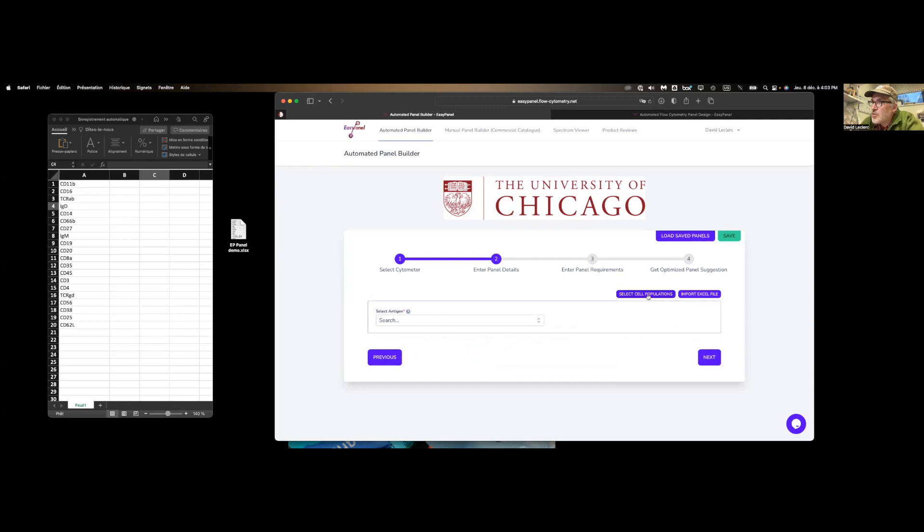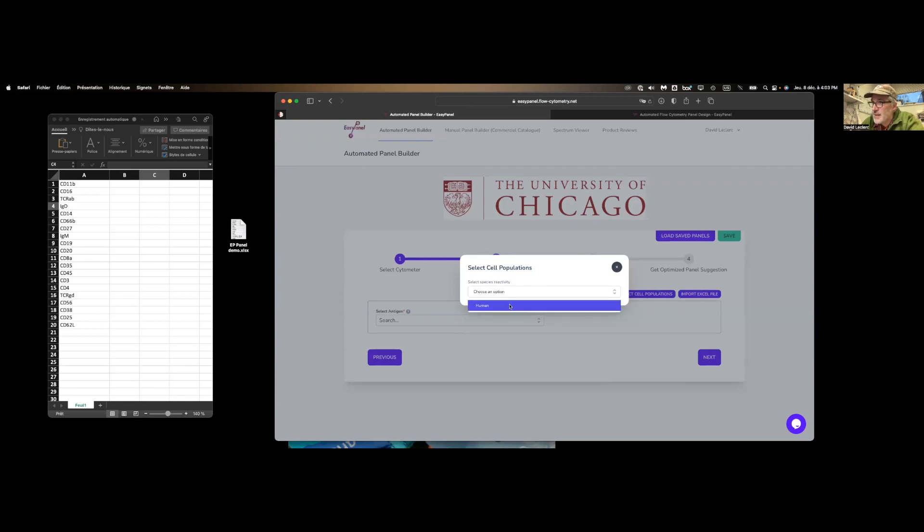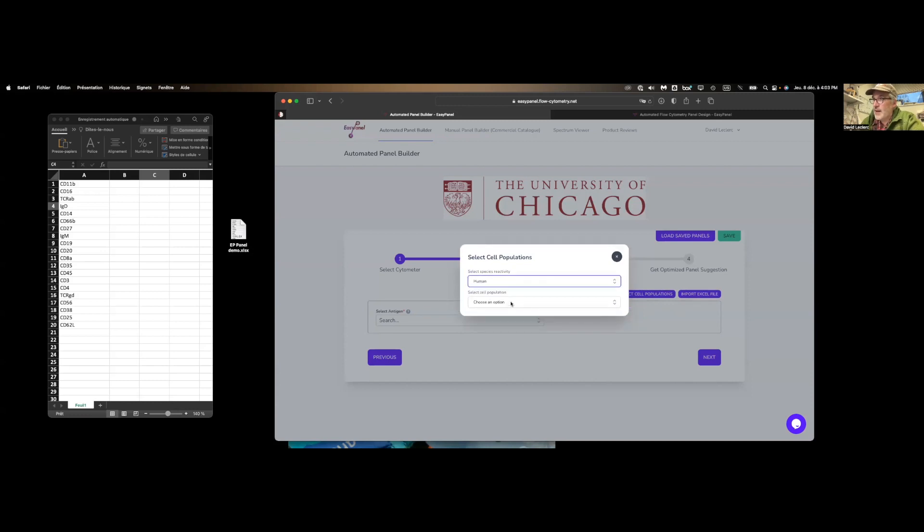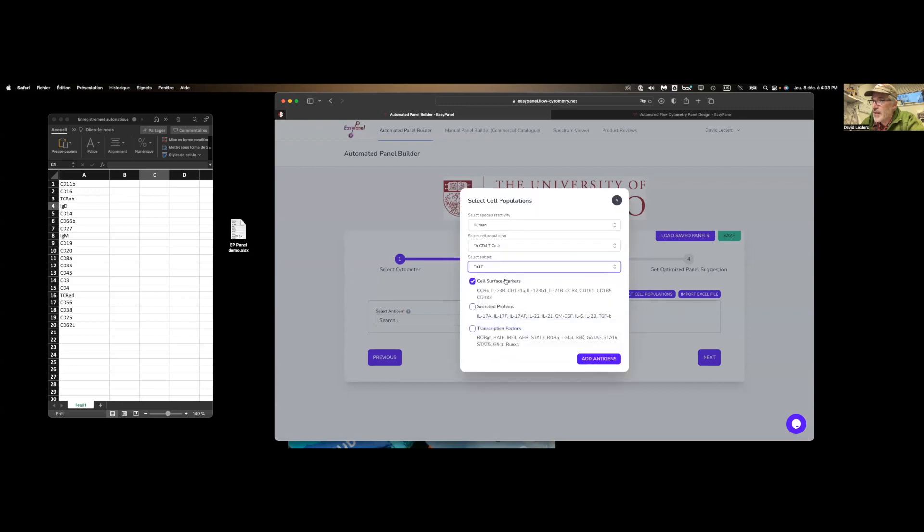So we can do two other things to enter your markers. You can use the pre-built panel that is in the tool. So here we're simply selecting a species, a cell population, and a specific subset that we want to look at, and then add specific markers.